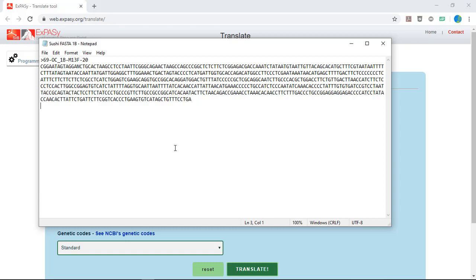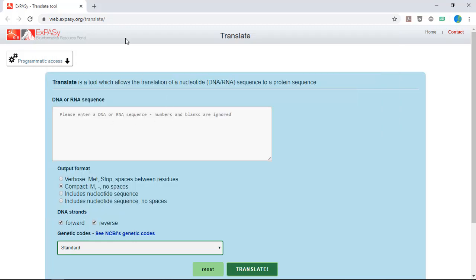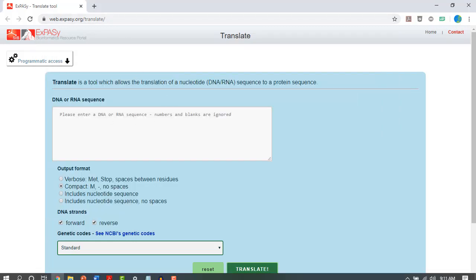First open the FASTA sequence file that you saved from MEGA. You can do this in Notepad or any text editor. Open a new browser window and navigate to the online XPACI tool.